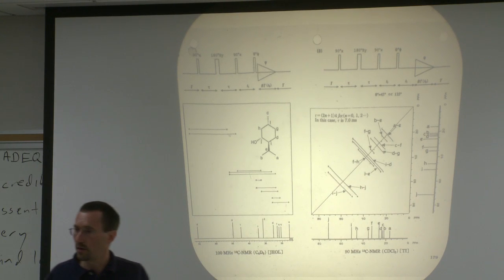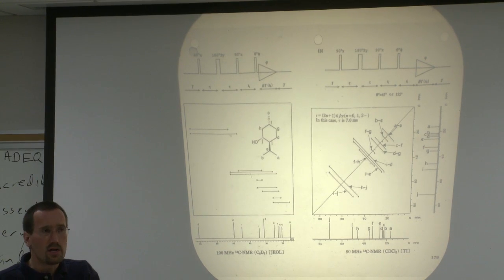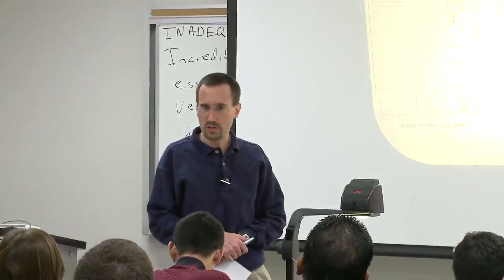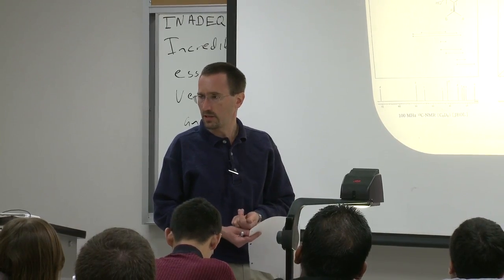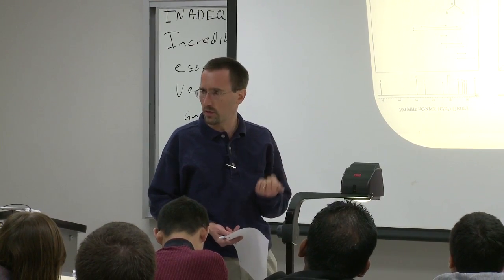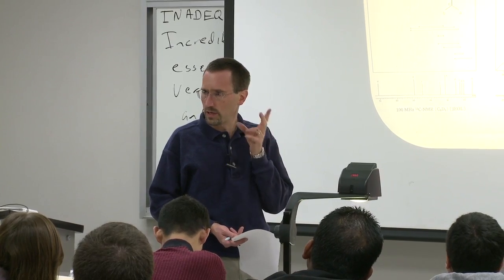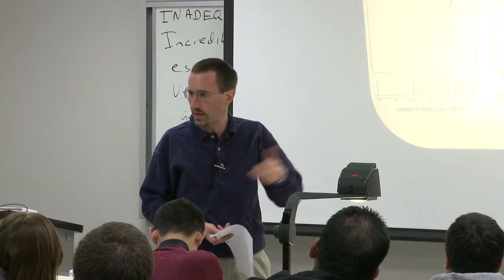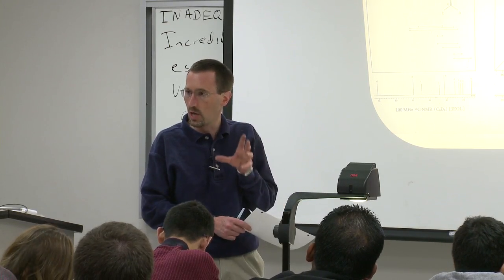When they do natural products chemistry, do they normally have enough of the natural products to do this? No, absolutely not. The natural products chemistry these days is often pushing the envelope. So Phil Cruz is a great example of this. And in fact, he has a really good NMR book. The only thing is, in my opinion, it's more oriented toward natural products chemists rather than toward, say, synthetic and other sorts of chemists who build molecules.